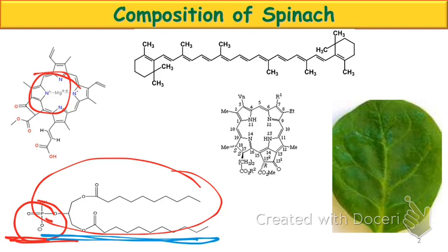So we've got to come up with some way that we can try and bulk remove some of that material. One way would be to grind it all up, pulverize it, so we break all the cell walls open. We're still going to have solid parts, so we can filter out the solid parts. And now we've got kind of a solution that has some organic components and some non-organic. Okay? What might we expect to see?